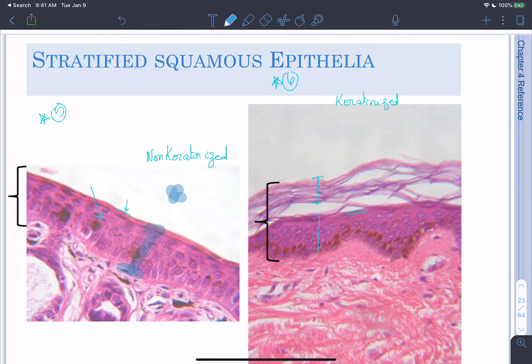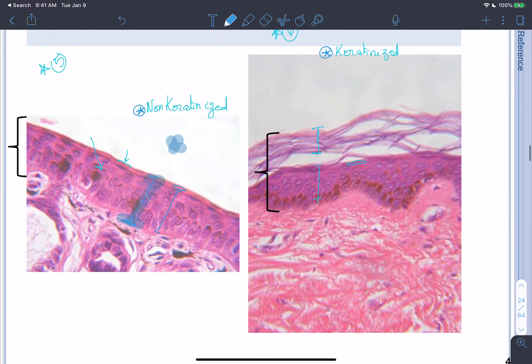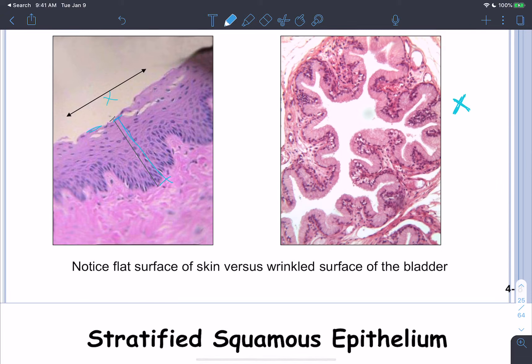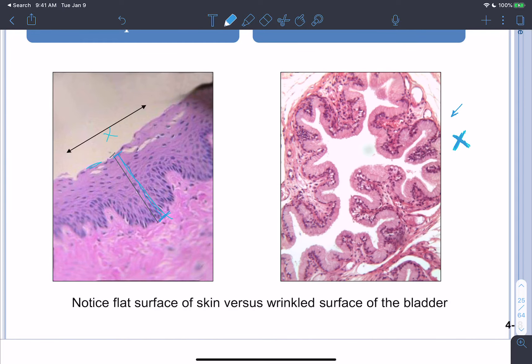Moving on, the stratified squamous epithelium has many cell layers with flat top cells. There are two varieties: the keratinized stratified squamous epithelium and the non-keratinized stratified squamous epithelium. One slide shown here is not that clear and is not a typical slide for transitional epithelium, so don't expect to see a slide like this on your test.